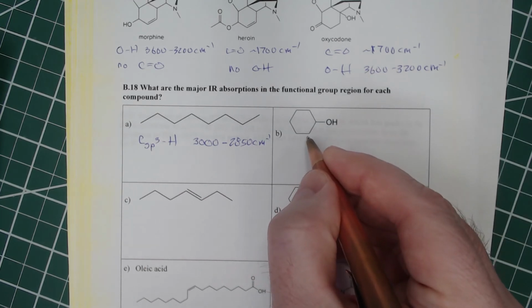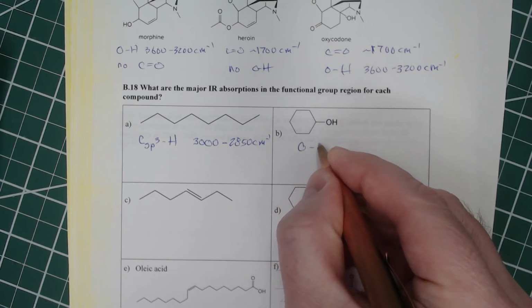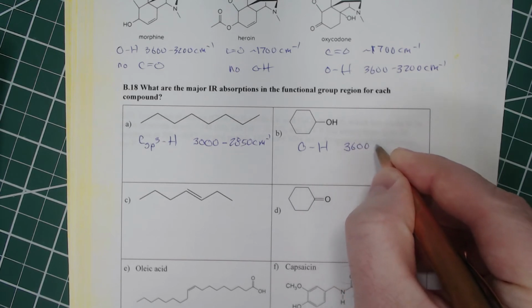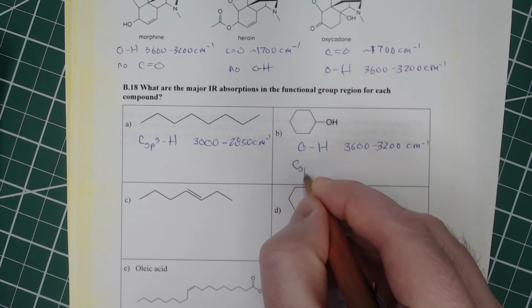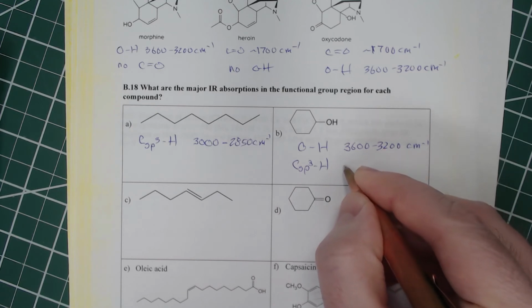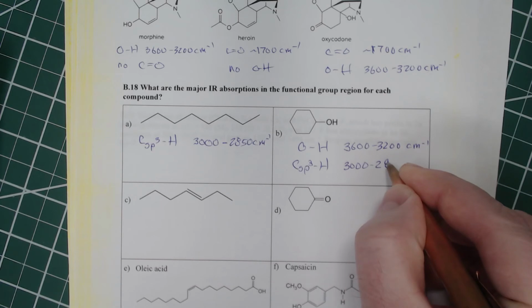All right, so here we've got cyclohexanol. The most prominent peak is going to be that OH peak, and now you know what that looks like. So 3,600 to 3,200. And then the carbon sp3 hydrogen is going to be the 3,000 to 2,850.